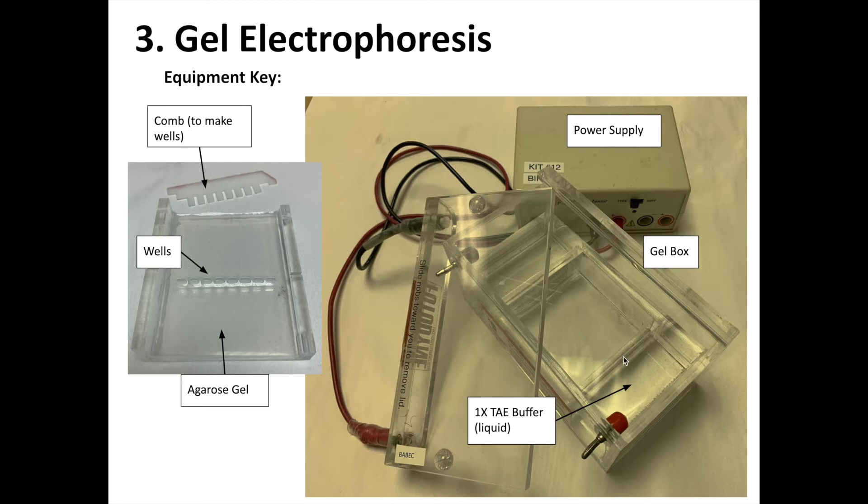Here's the lid of the gel box. Before putting that on, we add some more TAE buffer and attach the leads here to the power supply. And then we'll run electricity through the gel to help separate our molecules.